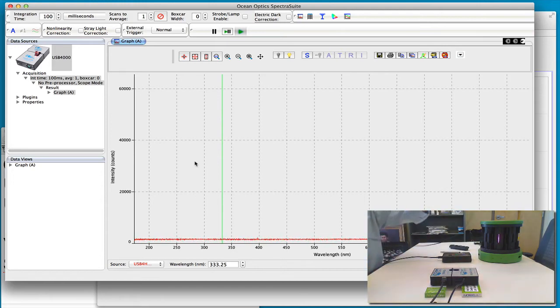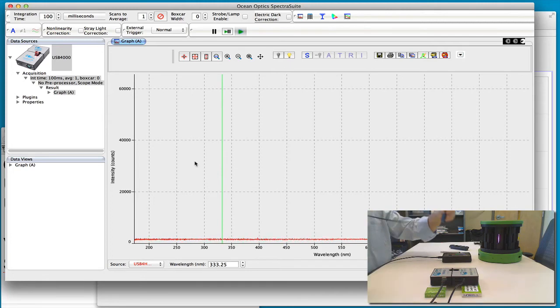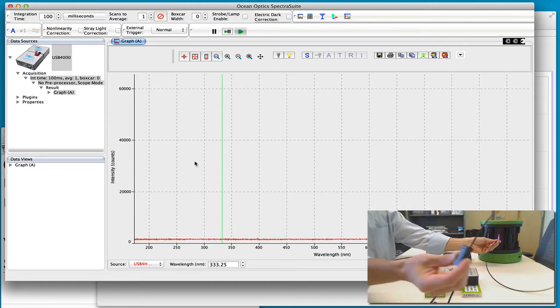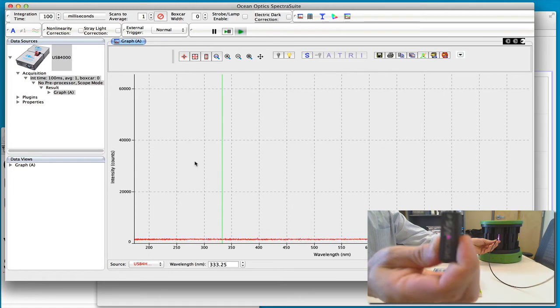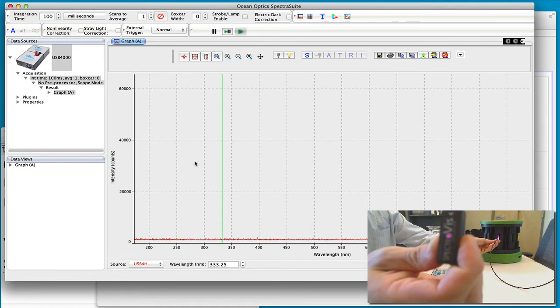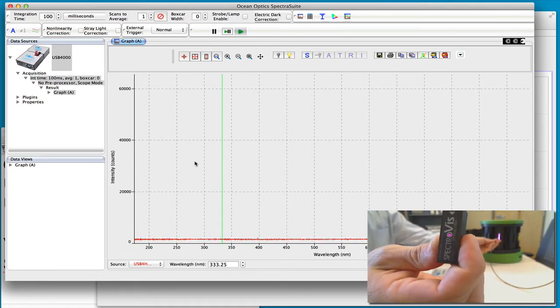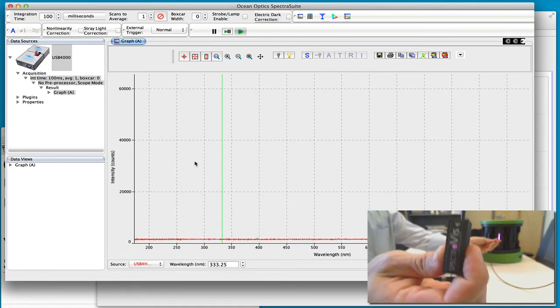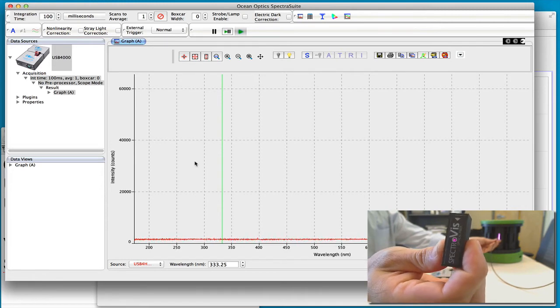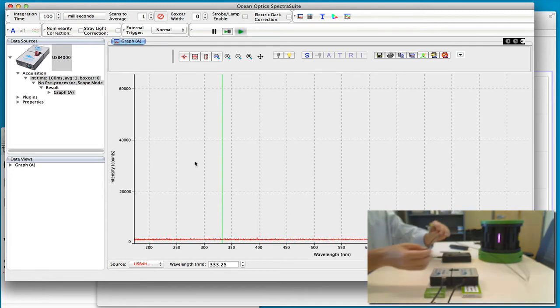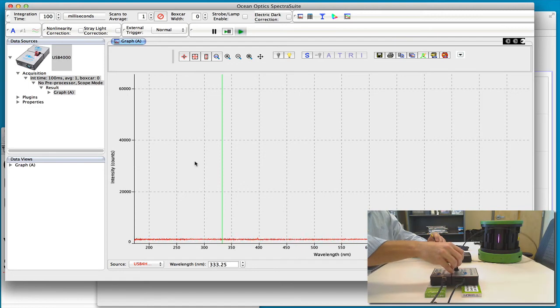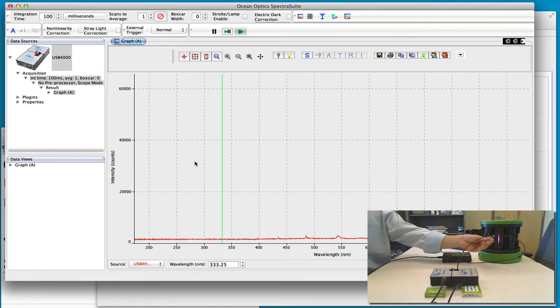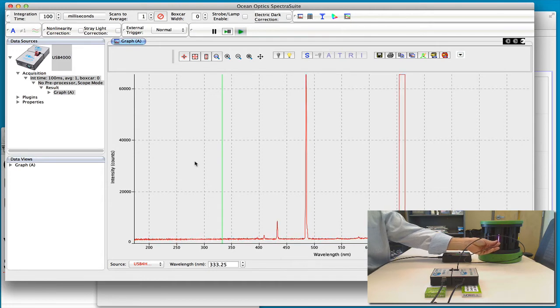Vernier sells a handy little one centimeter cuvette that's really just a fiber optics cable. So when you hold the fiber optics up to here you'll see that you can get the purple light coming through the center of that fiber optics, where that center of that cuvette-looking fake cuvette that we have here. So we can put that into our spectrometer and then hold it up here.